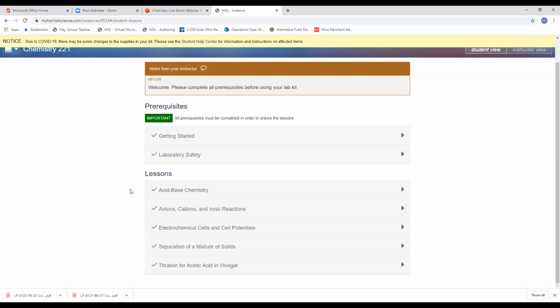And I also know, as having been a chemistry student way back long ago for multiple courses, that the first thing we did in the laboratory was spend at least a partial, if not complete, lab session on lab safety. And indeed, we have included that as a prerequisite in our lab manual curriculum. Safety is paramount for our company.